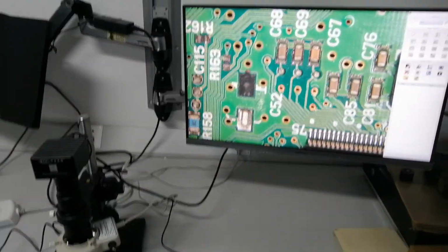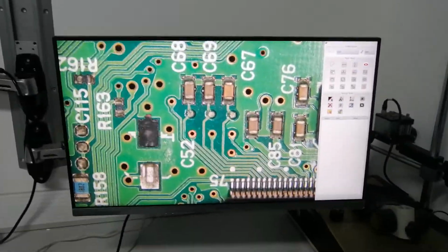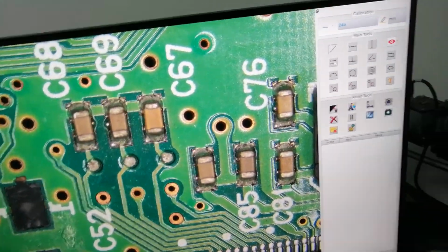Hello Martin, I'm going to take a video for you about the 4K microscope.